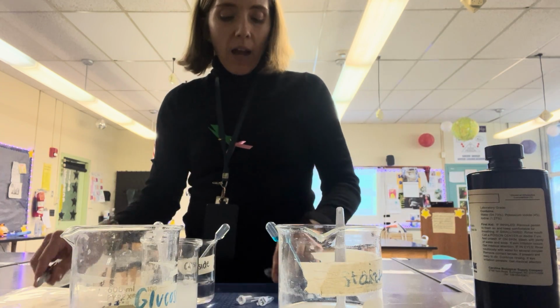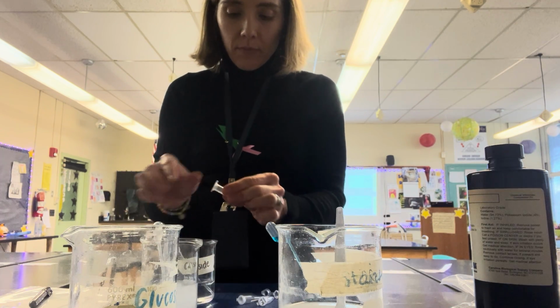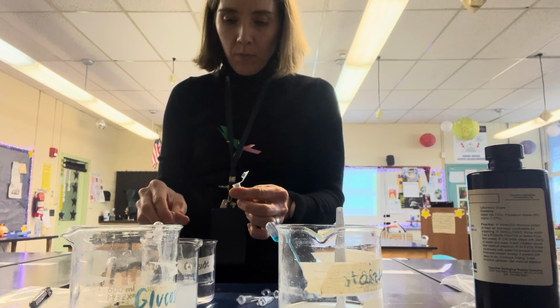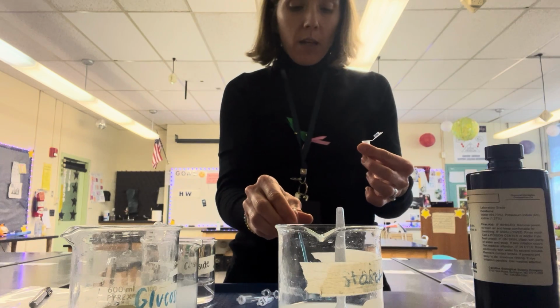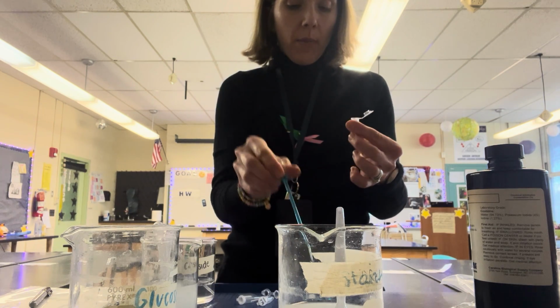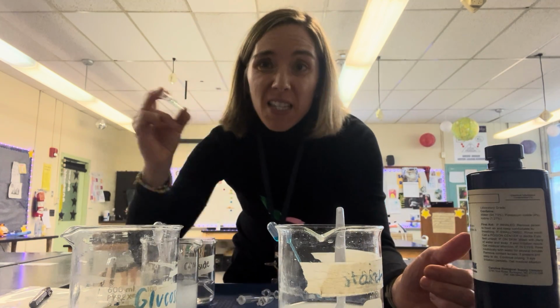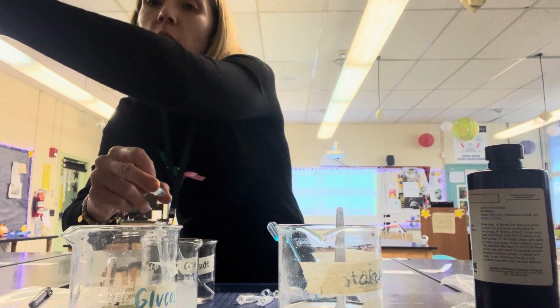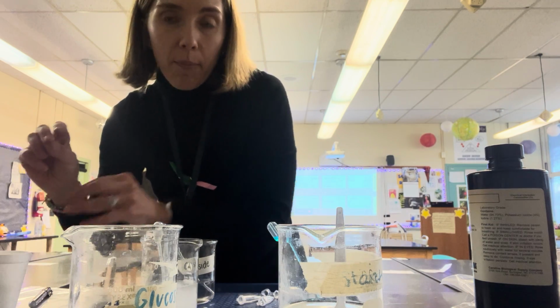All right, so for my outside Benedict's, I'm going to take some of the outside liquid, put it into the tube, and then I'm going to take about 3 drops of my Benedict's, cap and shake. Now the thing about Benedict's is it only works when it's put into a cup of hot water. So I'm going to have my cup of hot water, I'm going to put it into the side here, and we're going to see what happens.